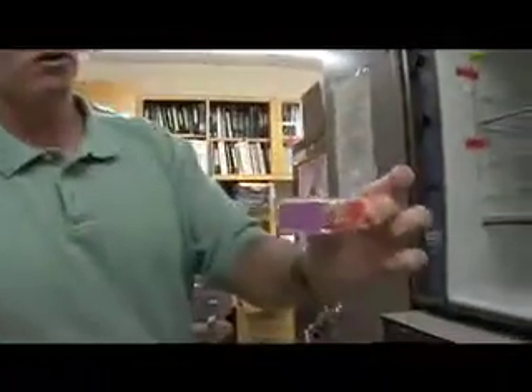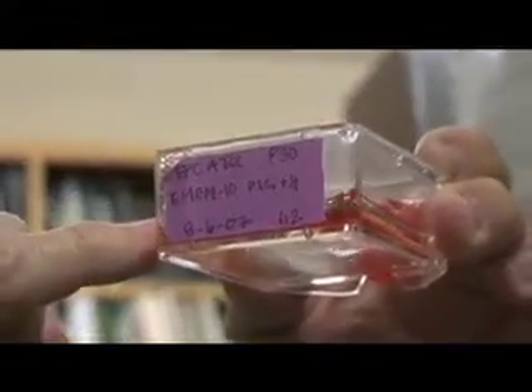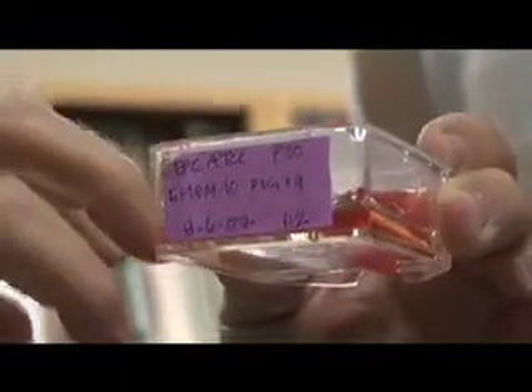In the incubator, we have our cell cultures, which have cells adhered to the underside of the flask. You can think of this as a living culture medium. The virus has to get inside a living cell, so here we have a sterile bottle of cells that we would infect with material we suspect of having a virus.